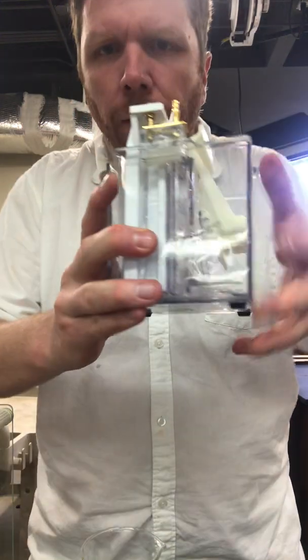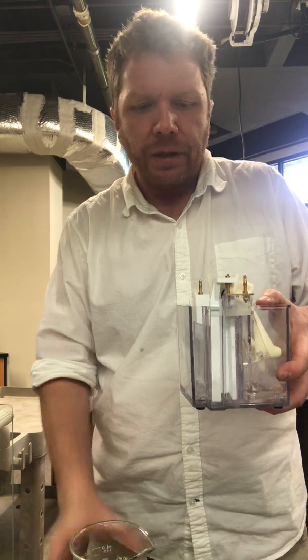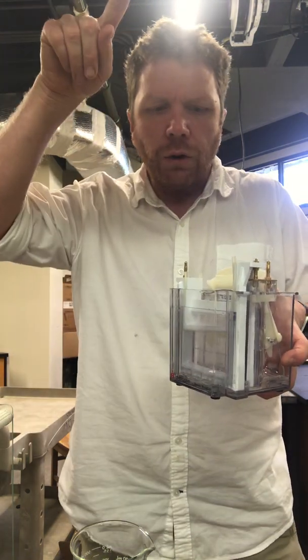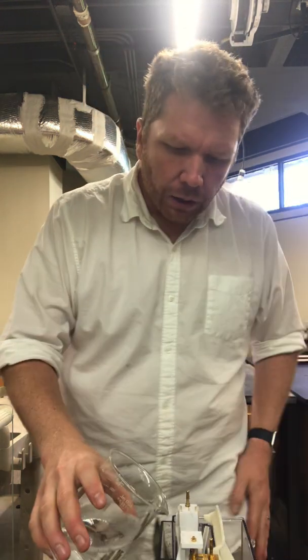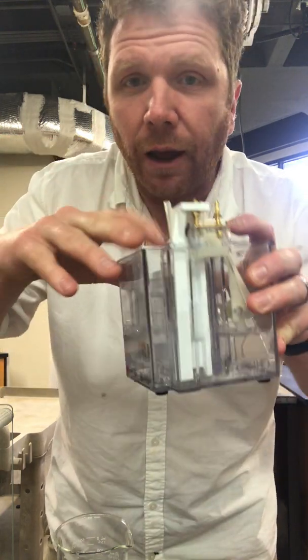What I'm looking for is I want very little of this solution to be outside of my chamber. In my central gasket, I want that to be filled all the way. Now, what I'm going to do, however, is overflow this central gasket. Remember that tape that I tore off? I wanted my current to be running through that solution and exiting my chamber. So I'm going to just add until it overflows. Now I've got solution in the outer chamber, but more than anything, I want my central chamber to be basically sealed up.